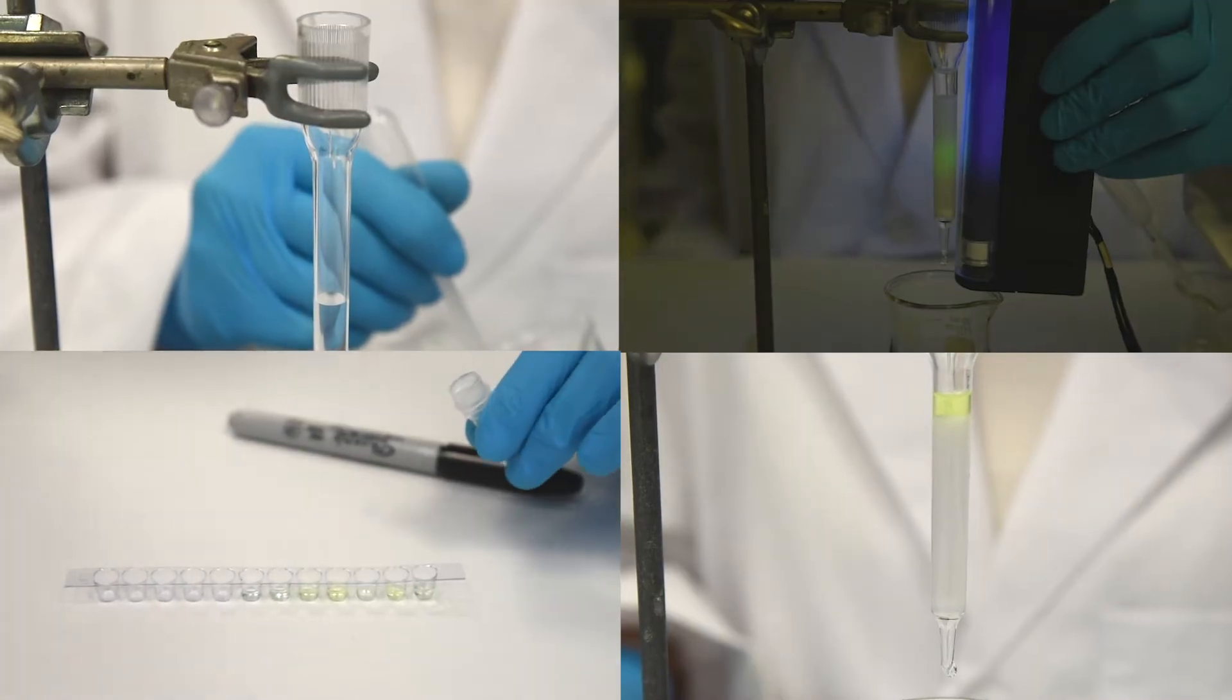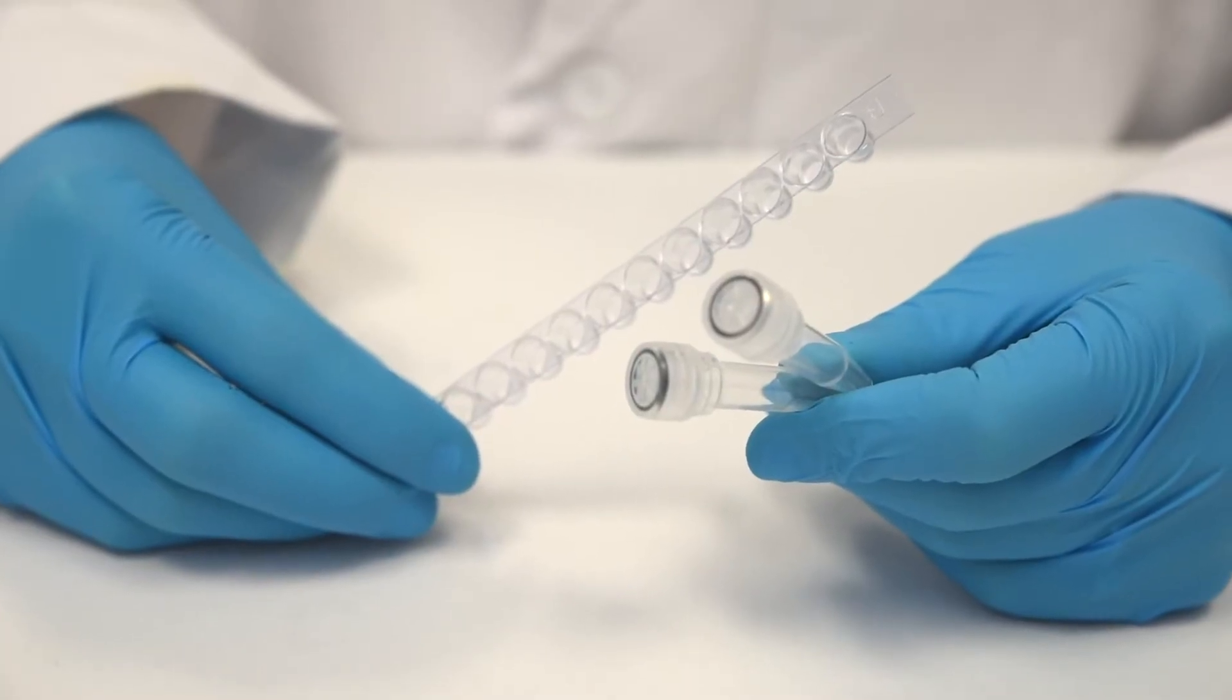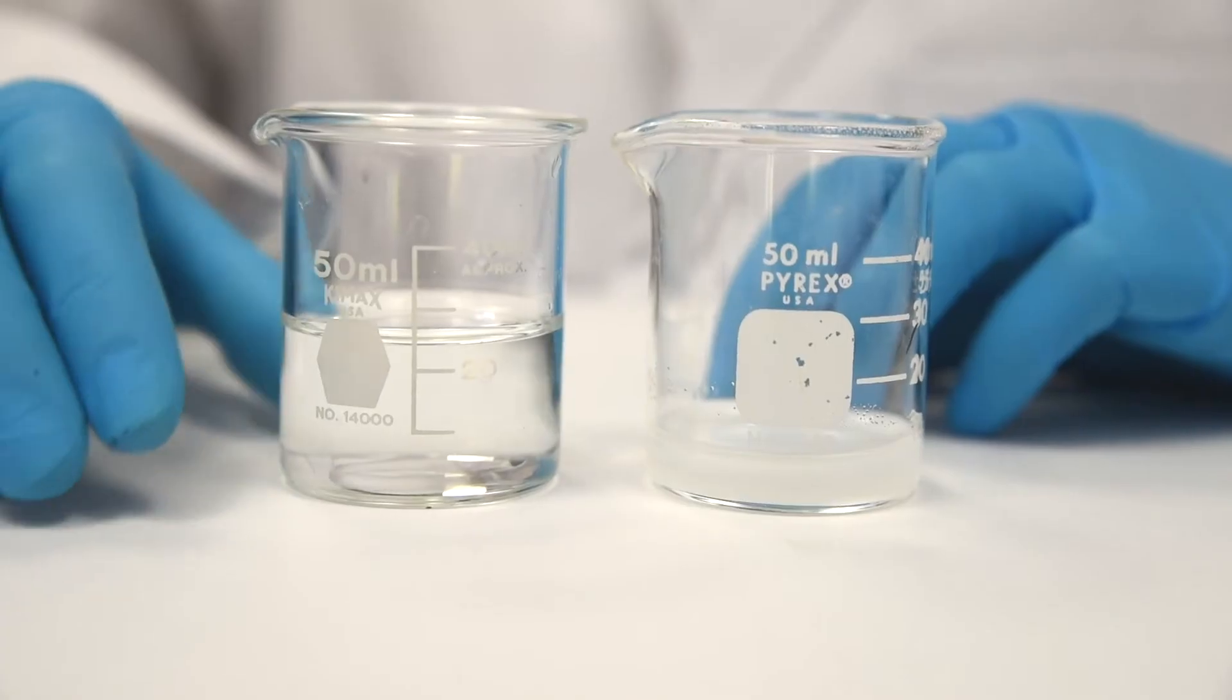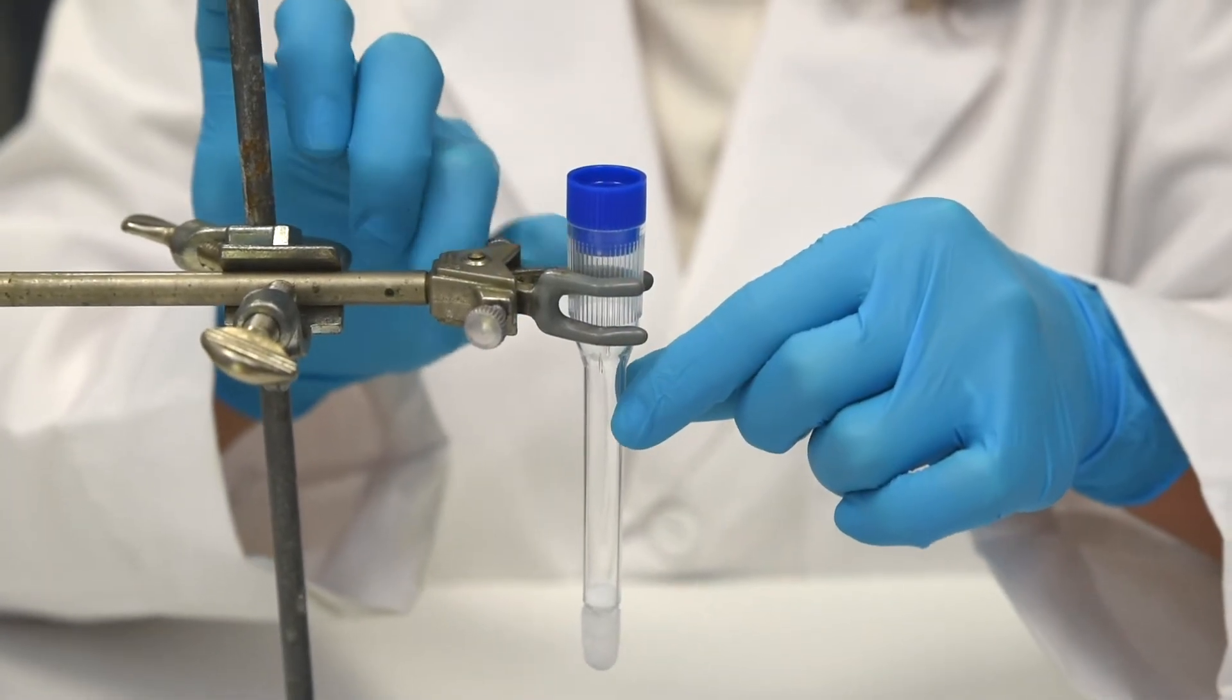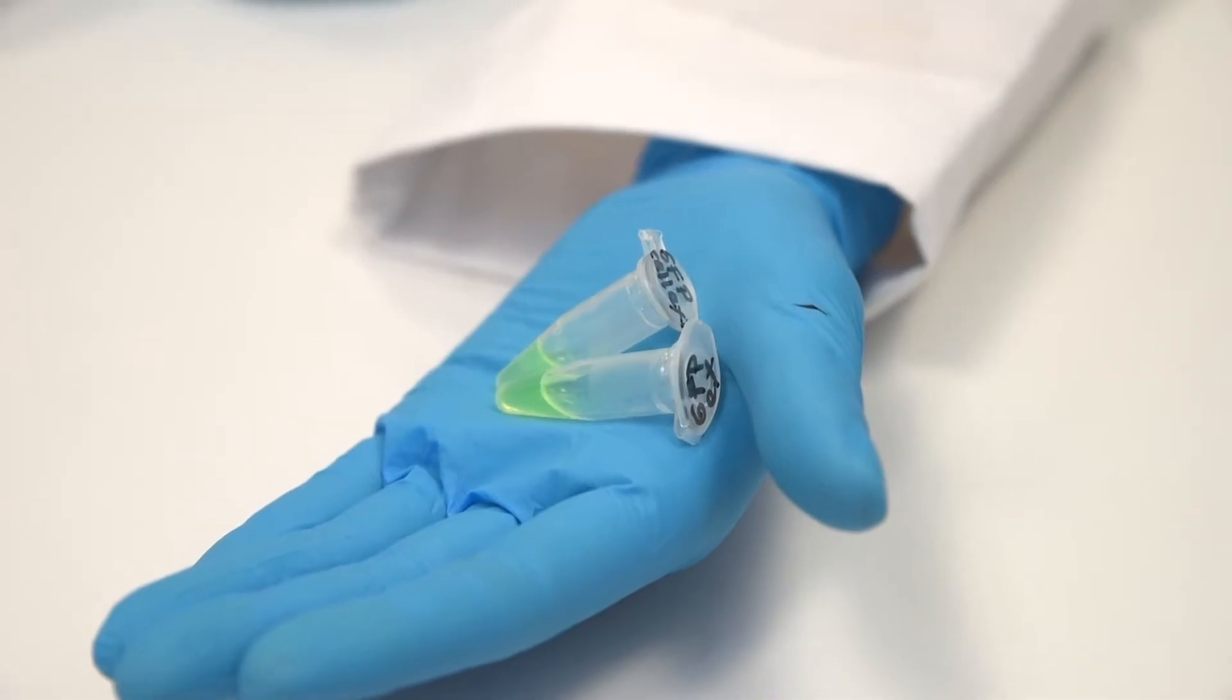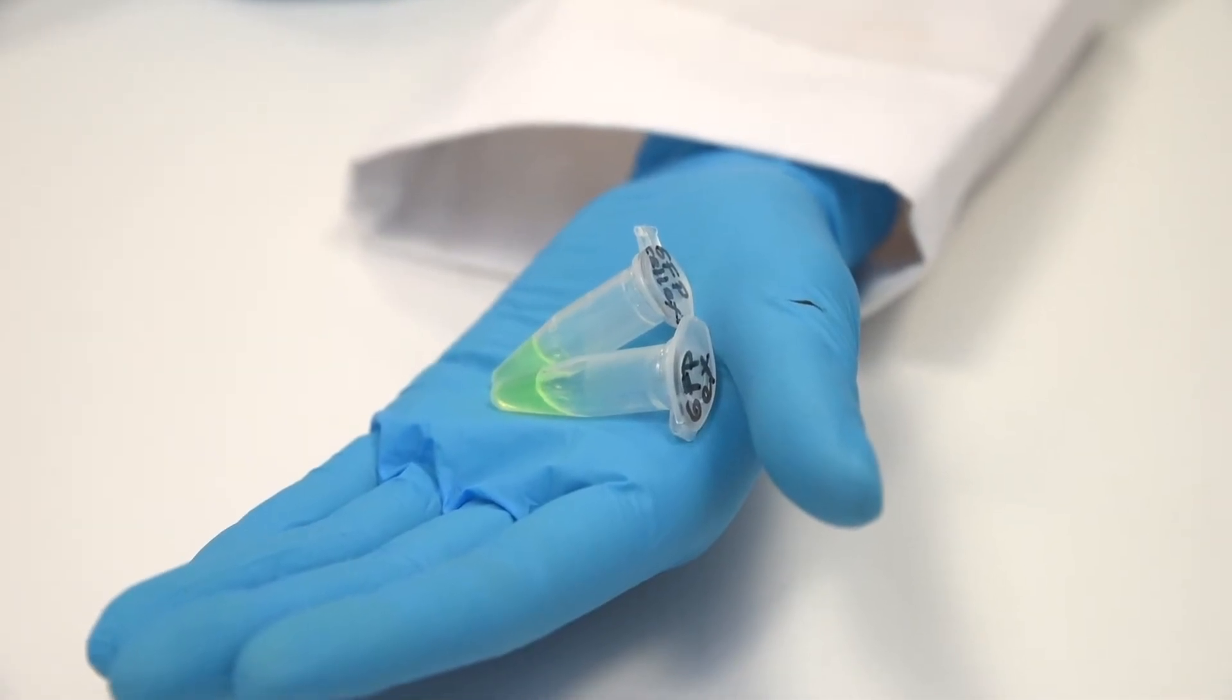For this module, you will need a microtiter plate, screw top microcentrifuge tubes, elution buffer, molecular sieve matrix, a ring stand and chromatography column, and GFP extract from Module 2 or control GFP extract.